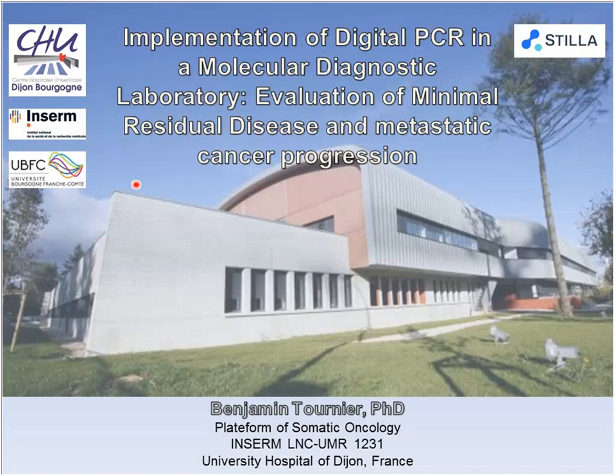And I will present you the digital PCR system that we use in Dijon, developed by Stilla Technologies.